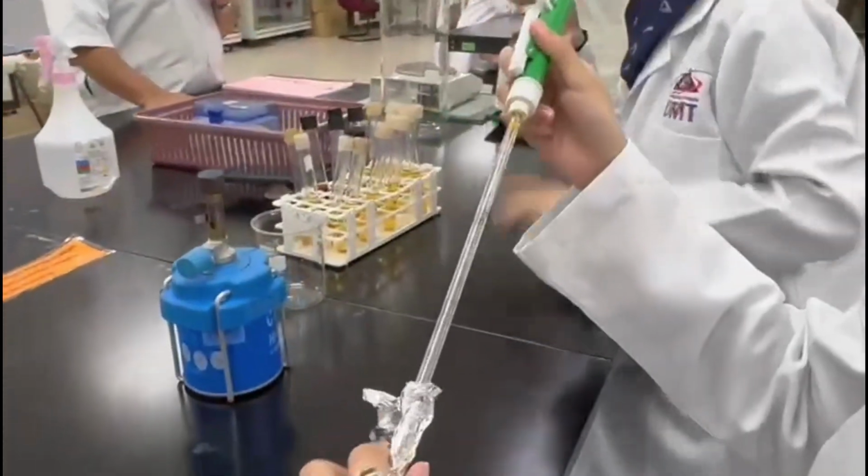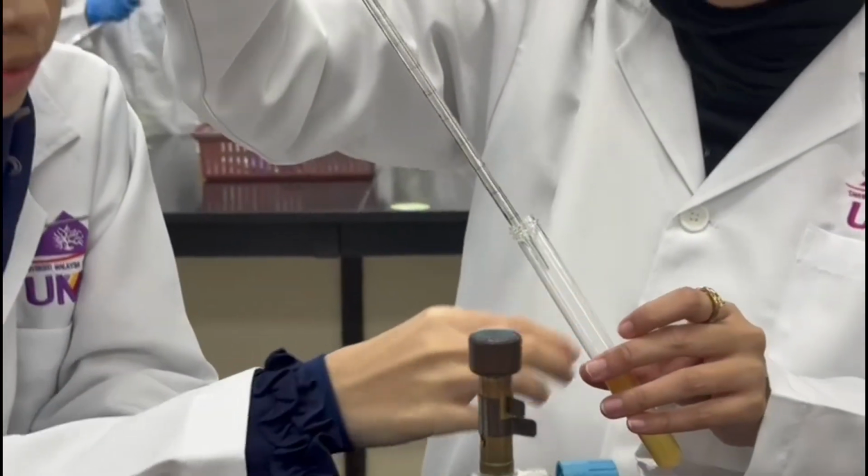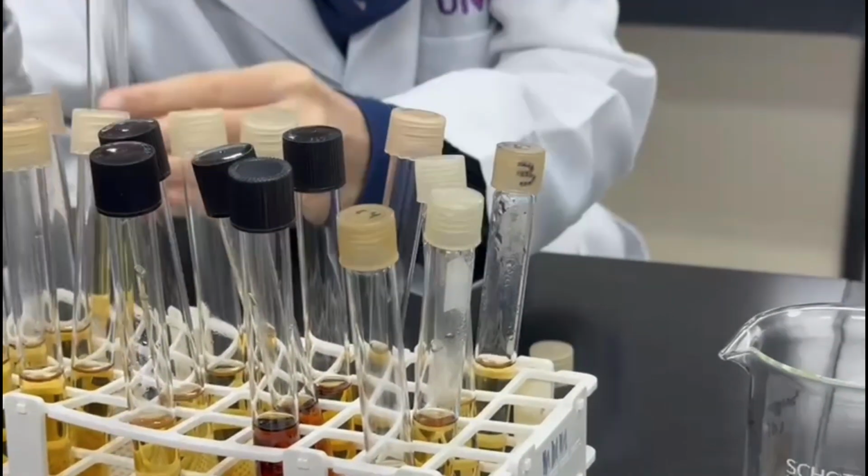For the method of salt and sugar, add 0.1 ml of the same culture into tubes containing different concentrations of salt and sugar to test the effect of osmotic pressure.